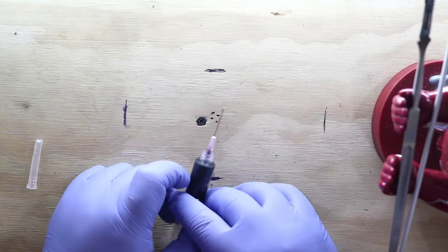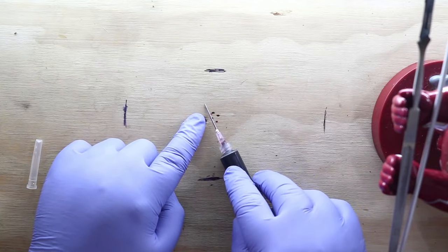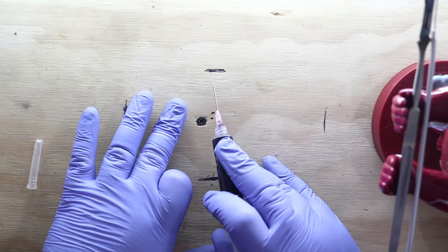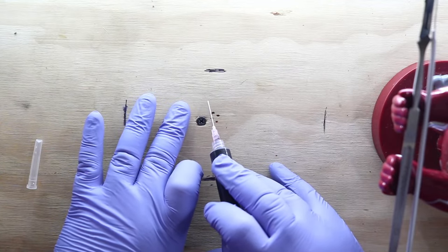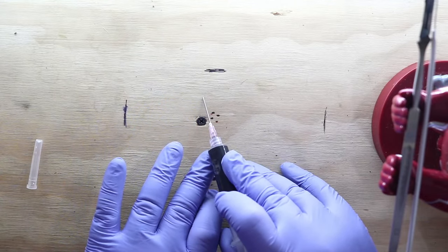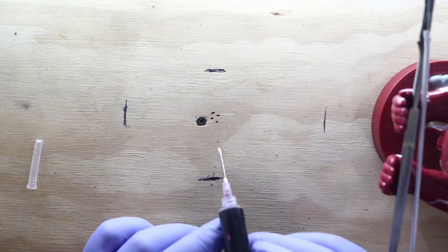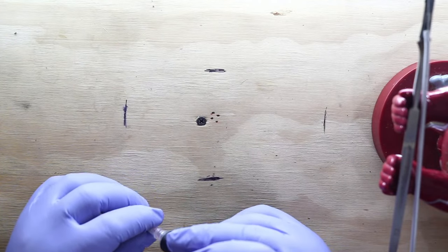What you're trying to do there is the smush to get a piece in, but on the bottom of the dish, it's flat and against that plastic. So when you try to pull it back out, you're having to break the suction of the agar. And the best way to do that is to lever it up by turning it so you kind of peel it off, right? And then you're able to lever out and extract it. So like smush, scoop, and lever. Yeah, lever. Smush, twist, scoop, and lever.